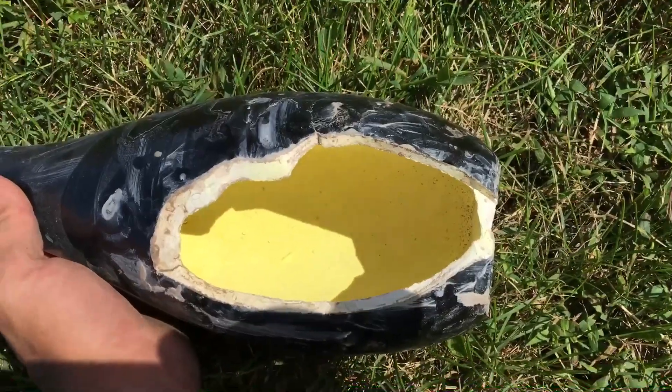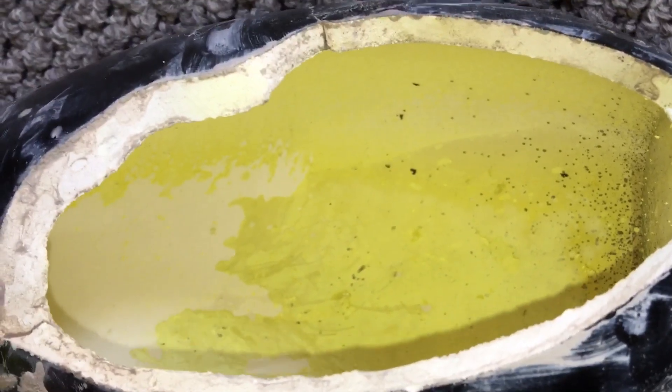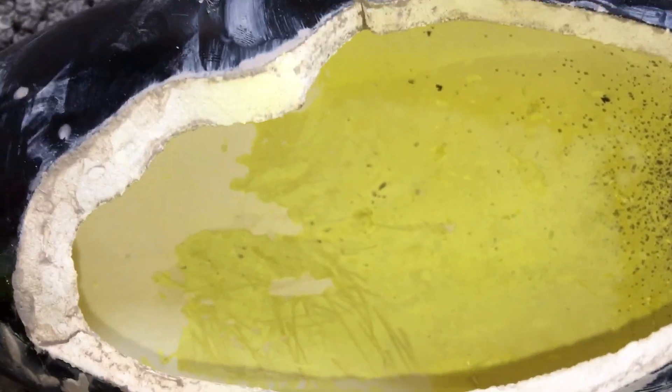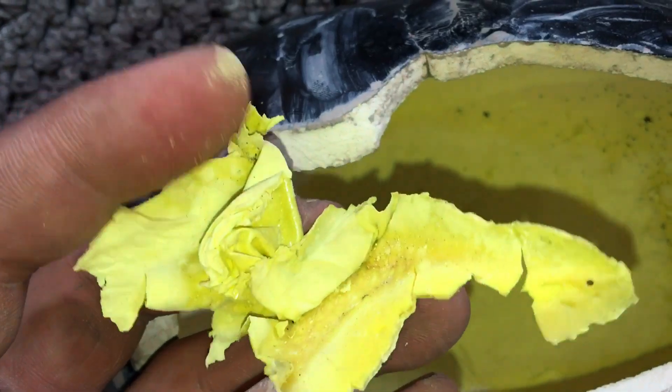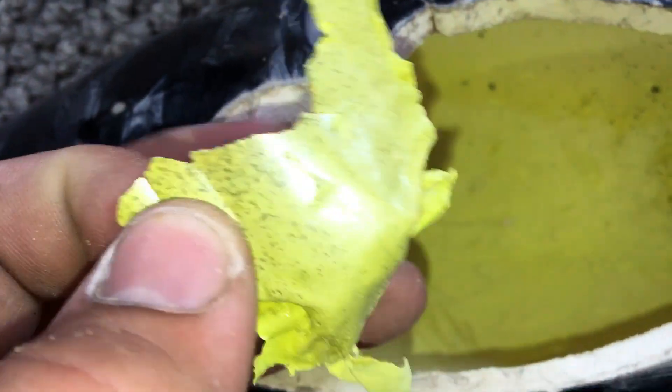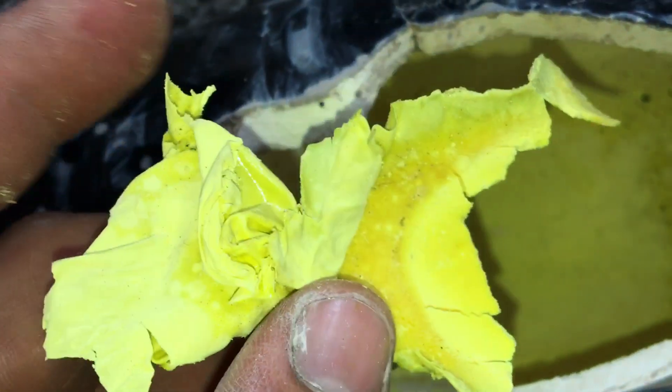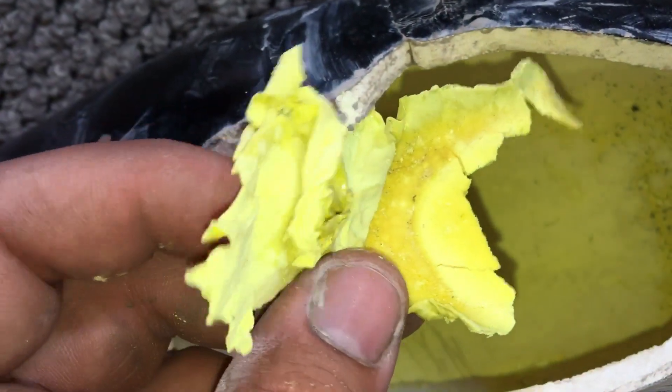I'll try to scrape it out. I've been trying to scrape this sulfur out of the bottle. The problem is it really wants to stick to these unglazed parts. This right here was just the biggest piece I was able to get out — it's not super clean. I think I'm going to try to dissolve it in xylene or paint thinner to purify it a little bit.